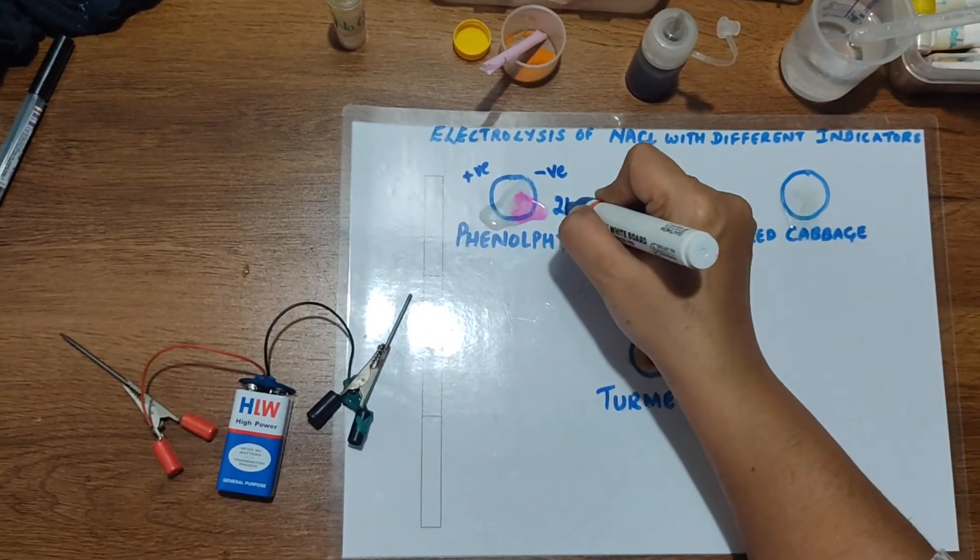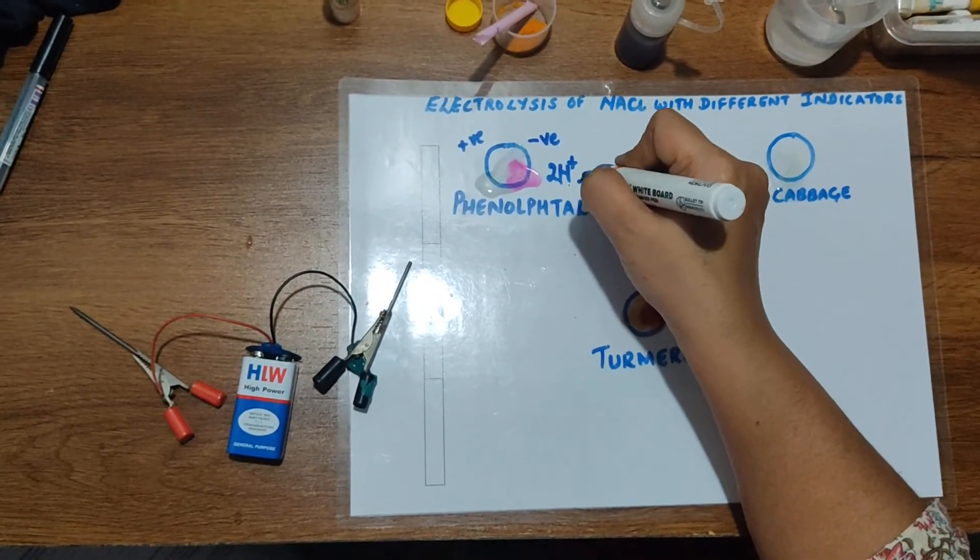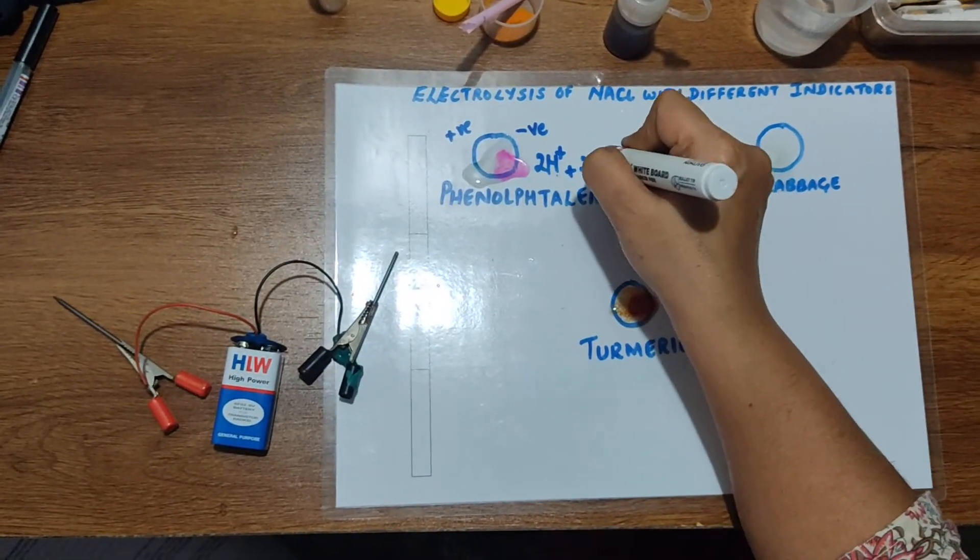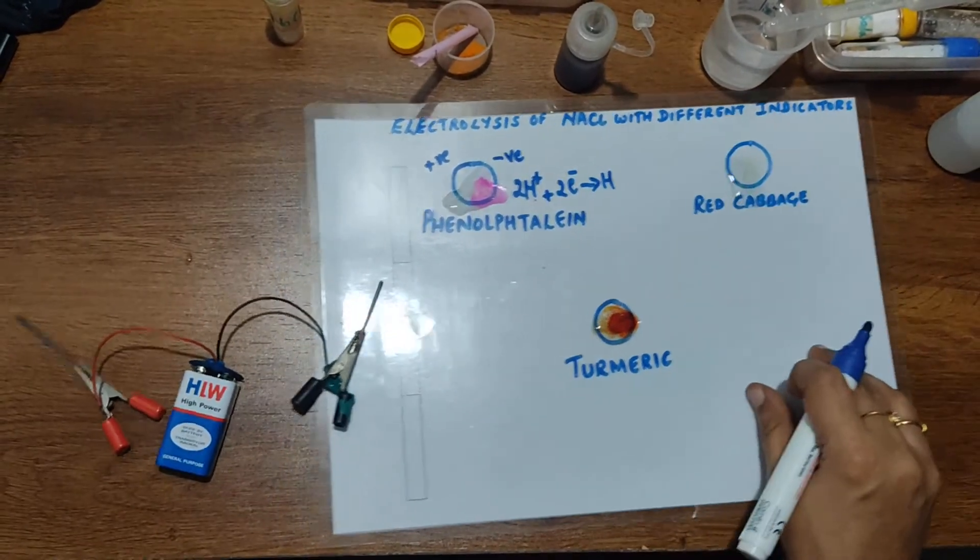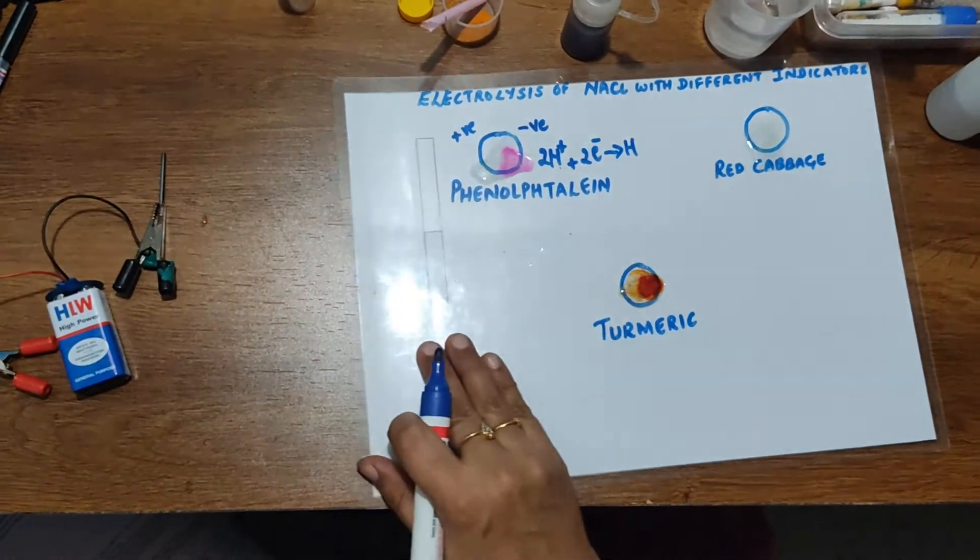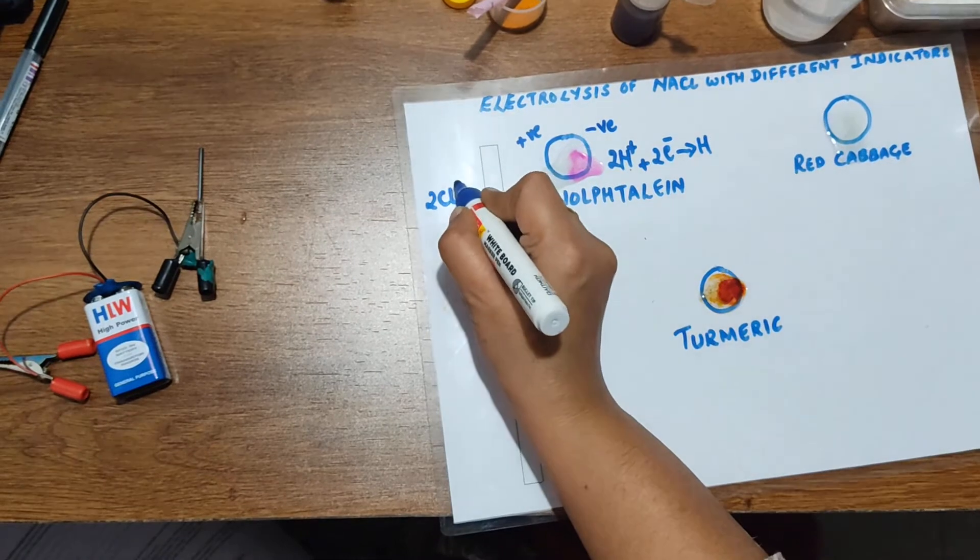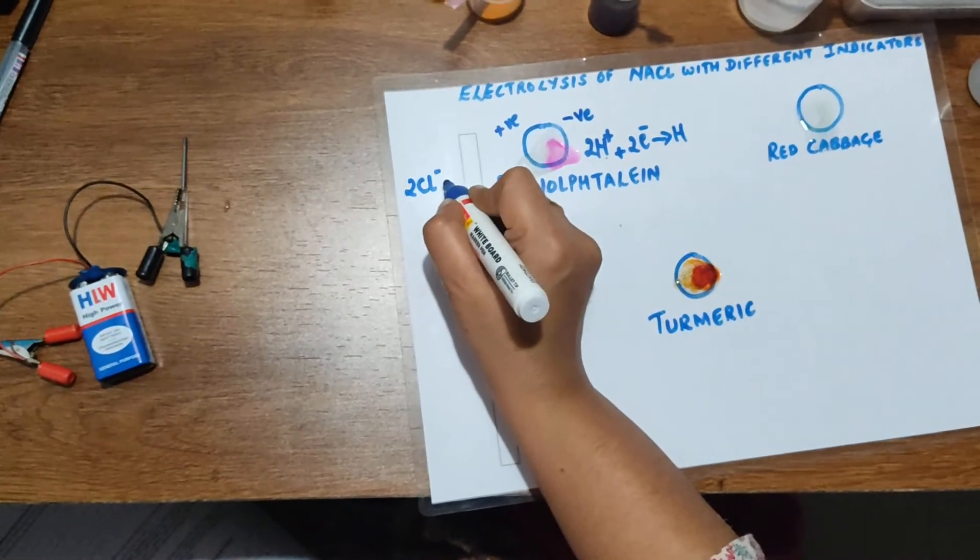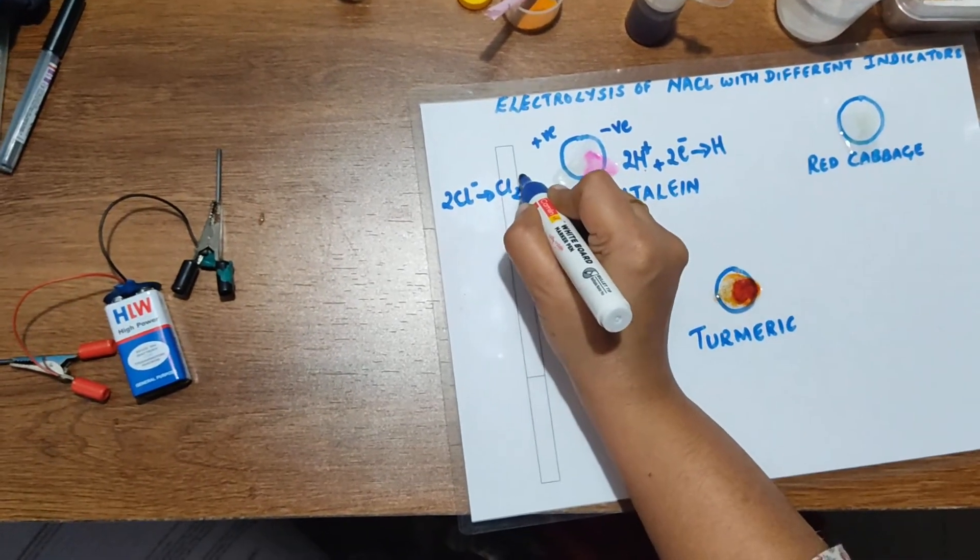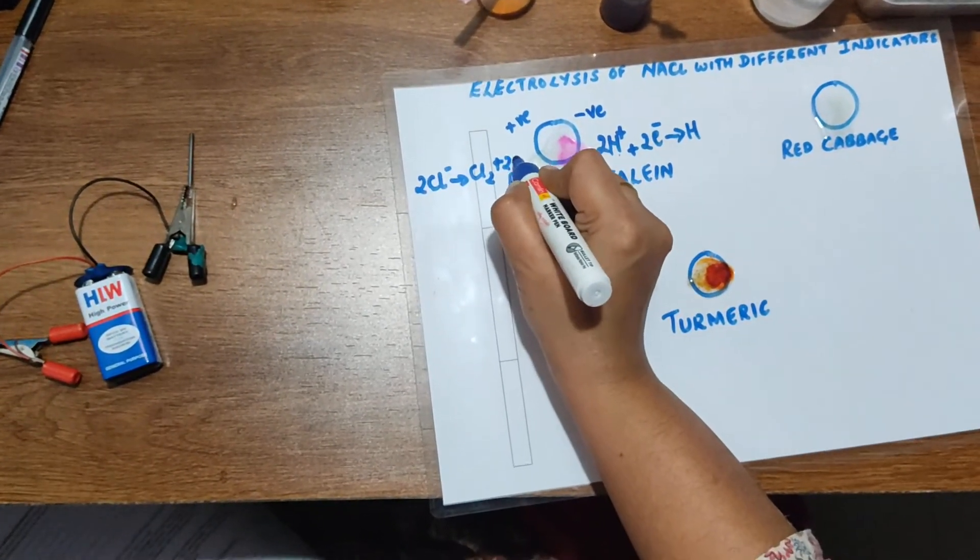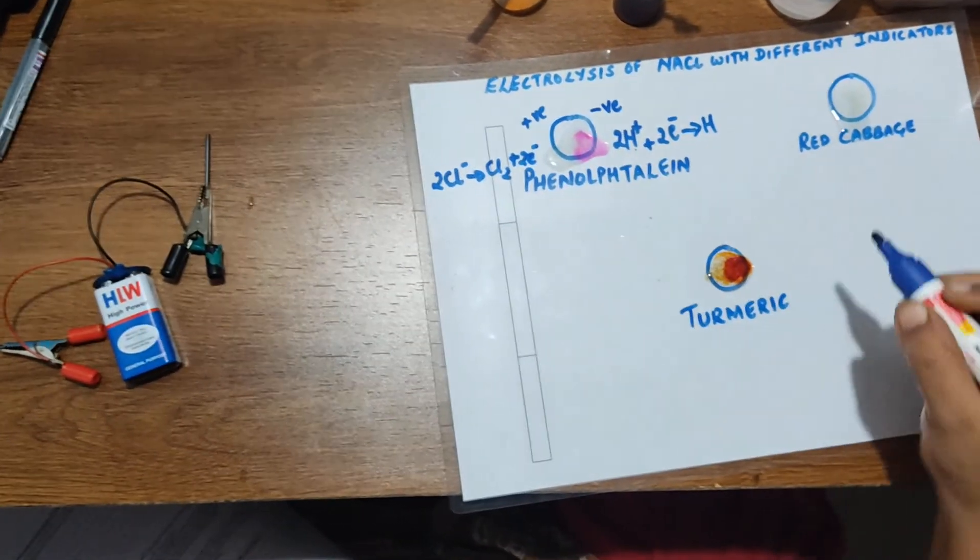Here the reaction would be hydrogen gas at the negative electrode, and at the positive electrode it would be chlorine gas liberated here.